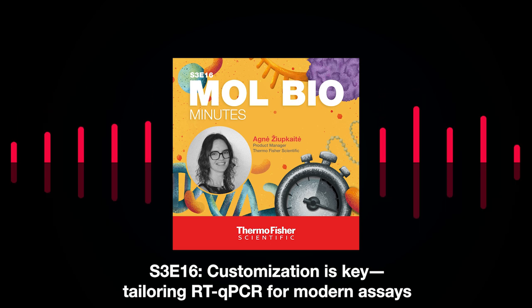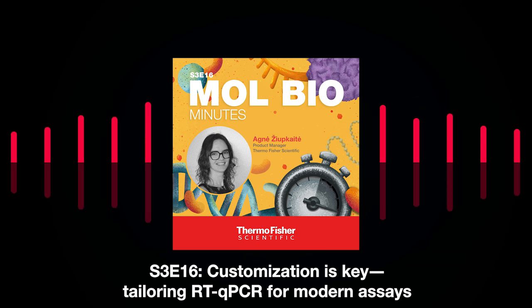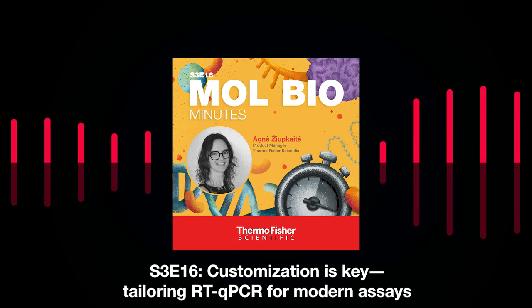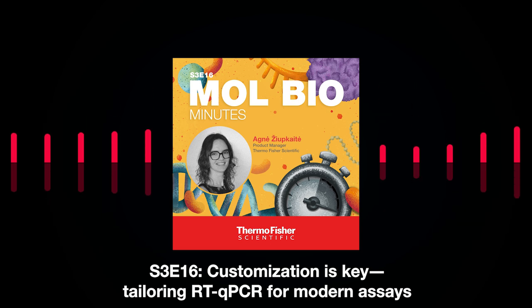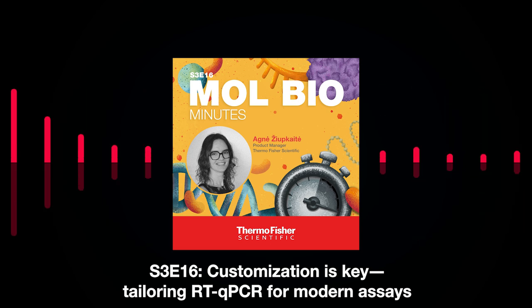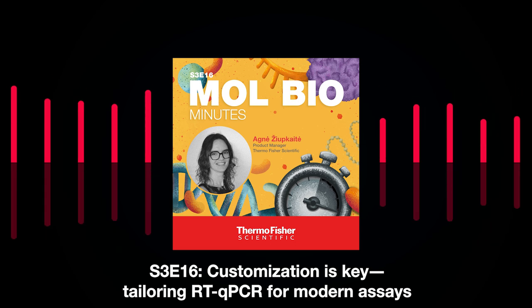The sensitivity and specificity of the assay, which are crucial for detecting low abundance targets and distinguishing between closely related sequences. Additionally, factors such as sample quality, reagent selection, and data analysis methods play crucial roles in the overall success of the assay.